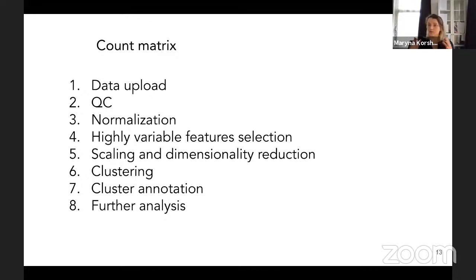That is why you have to reduce the number of genes, or of this basis, of this group of genes that you will take into account in your further analysis. So after having different profiles, you apply different clustering algorithms and receive separated clusters.